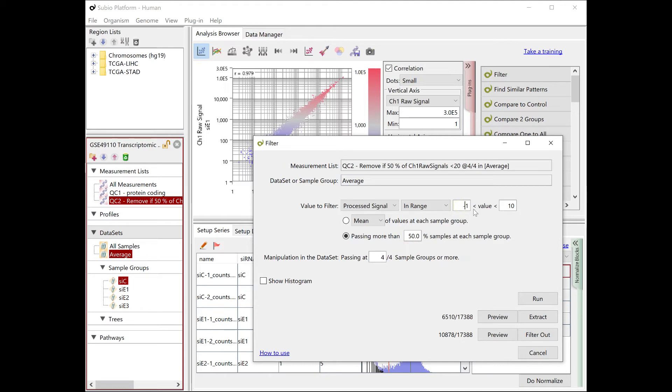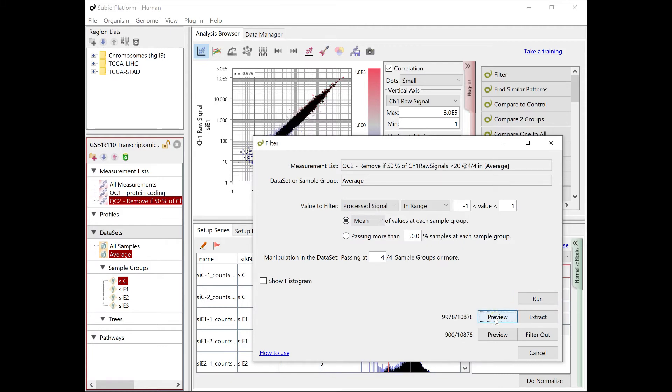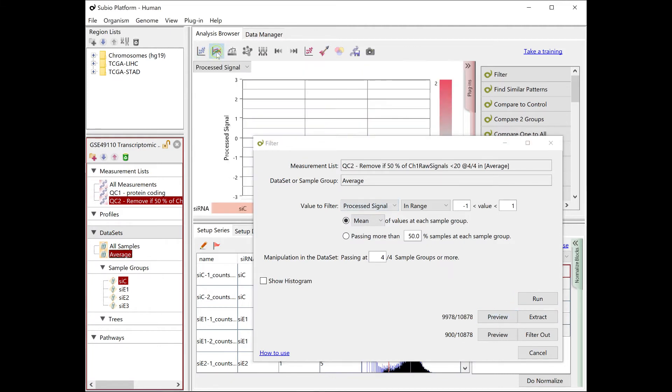Collect the genes whose processed signals are always between minus 1 to 1. More than 90% of the genes pass the filter.